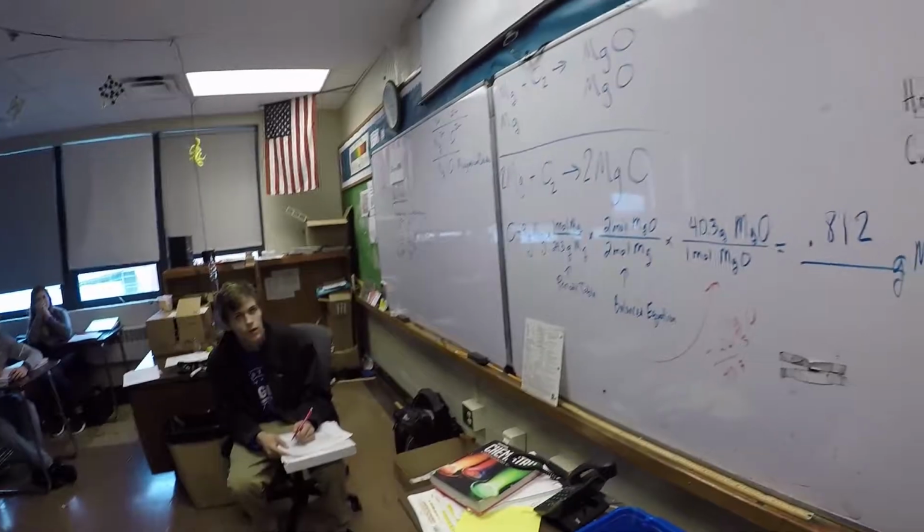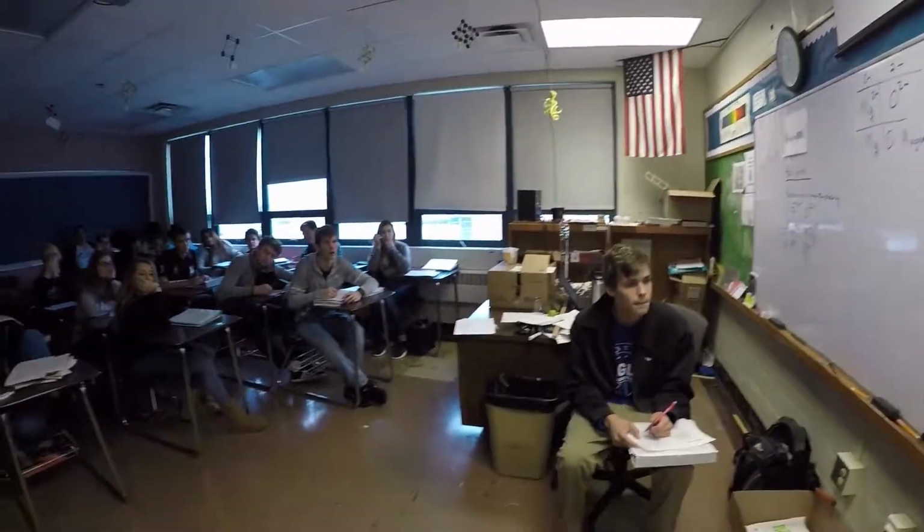Yeah. So, now the last question here. Will the ash weigh more than the metal? Raise your hand. Yes. Yes, the ash will.